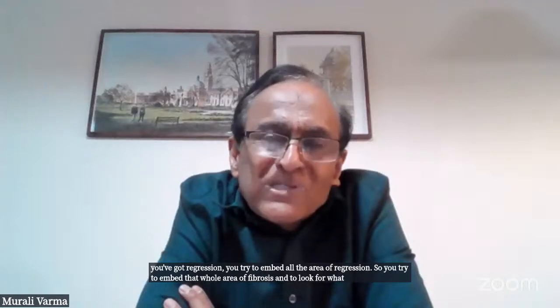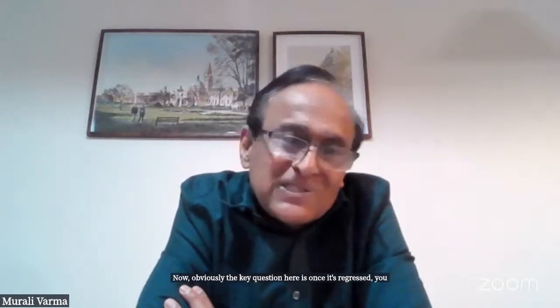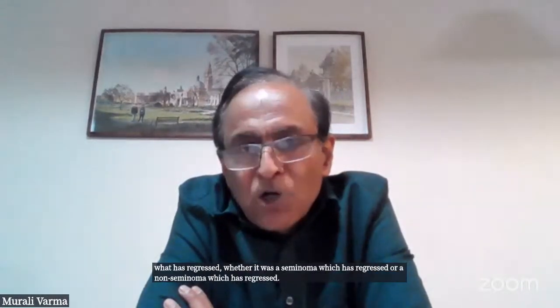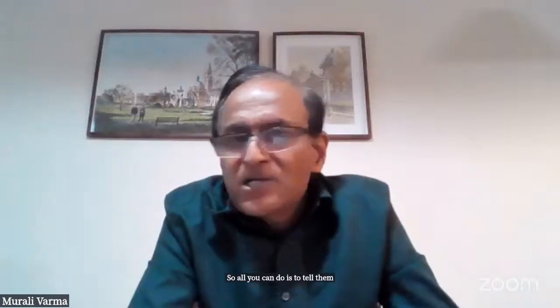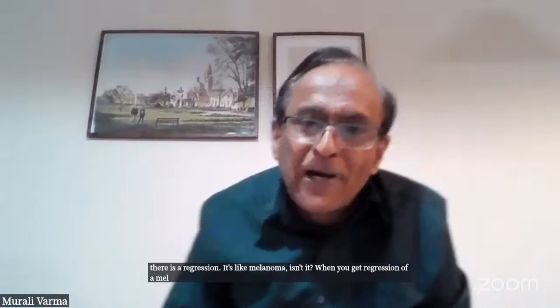Now, obviously the key question here is, once it's regressed, you don't know what has regressed, whether it was a seminoma or a non-seminoma. Or if it's a non-seminoma, what were the components of the non-seminoma? So all you can do is tell them there is a regression. It's like melanoma, isn't it? When you get regression of a melanoma, we have no idea what was there.